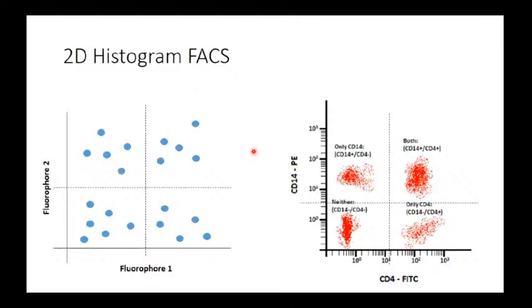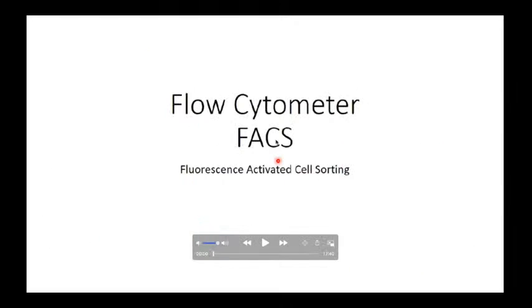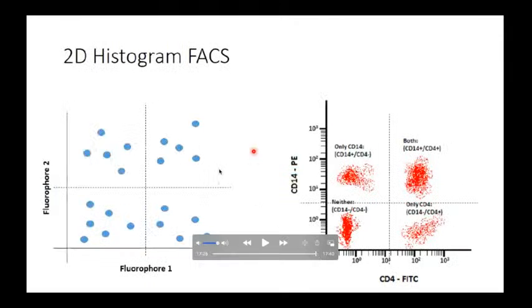So that was quite in detail about FACS analysis. In the end, it's all about the data analysis, how you could interpret your data from the two proteins here. In the earlier case, we had forward and side scatter. In this, we have two fluorescent dyed proteins. So according to that, we have different data.